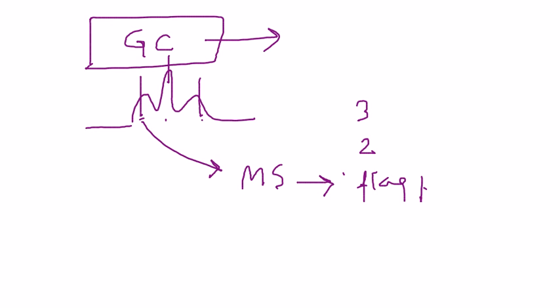Now, realize when you're applying the nitrogen rule, again, the nitrogen rule states that if you have an odd molecular mass, then that means that you have an odd number of nitrogen atoms, and if you have an even molecular mass, that will have even or no nitrogen atoms.